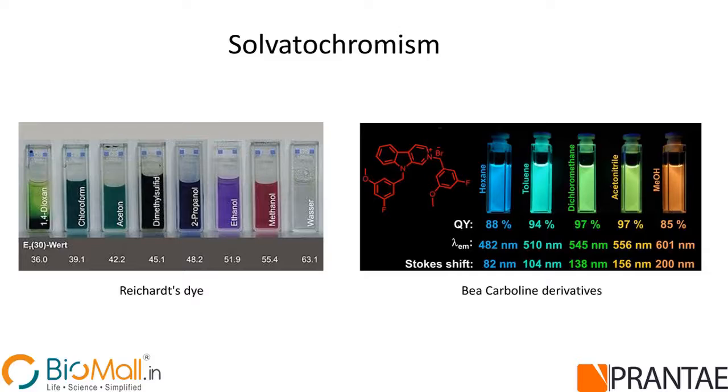Now, when we are talking about sensing per se, whatever I talked about until now was about what essentially is fluorescence and where you are using it. But in all those systems, fluorescence was essentially a signal generator, a point which was generating some signal which I can measure. The fluorophore was not a molecule that was doing any sensing per se. The sensing was happening due to other components in the system.